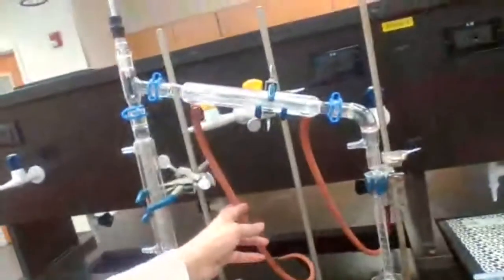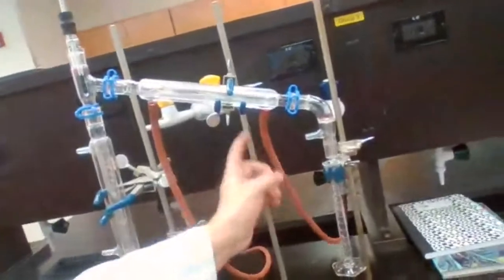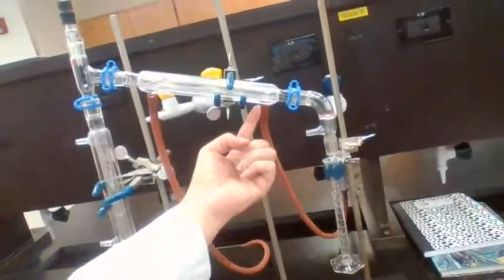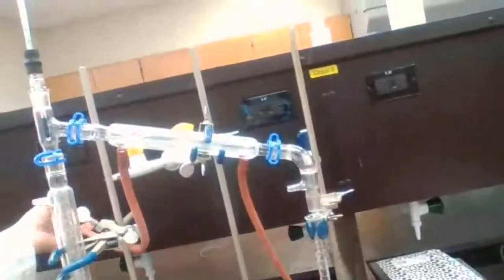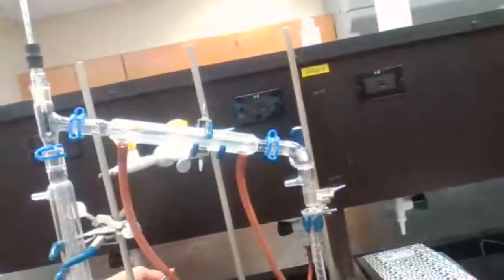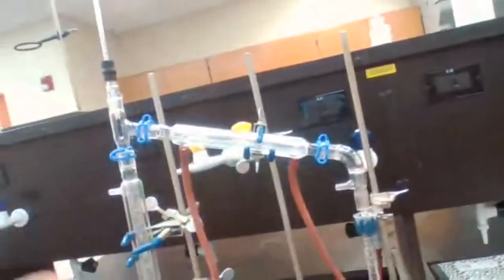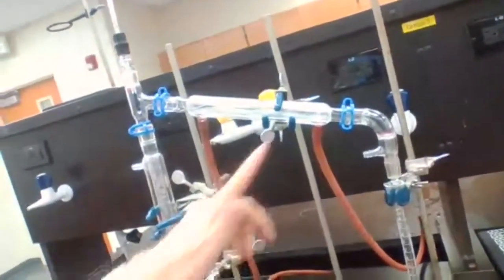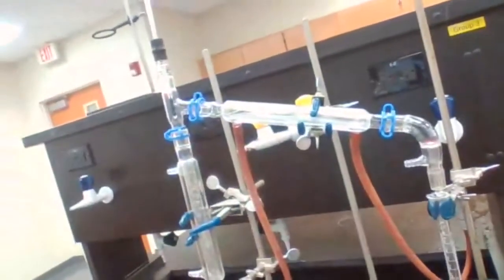The water hoses are connected, the lower end to the faucet, water coming in from the lower end and going out to the drain. So this part of the hose is loose, just for the water flow to go out. Water should be on gently. We should have a gentle water flow here.